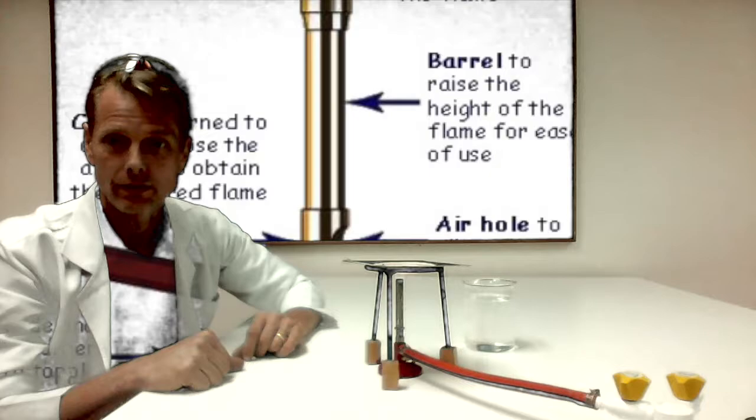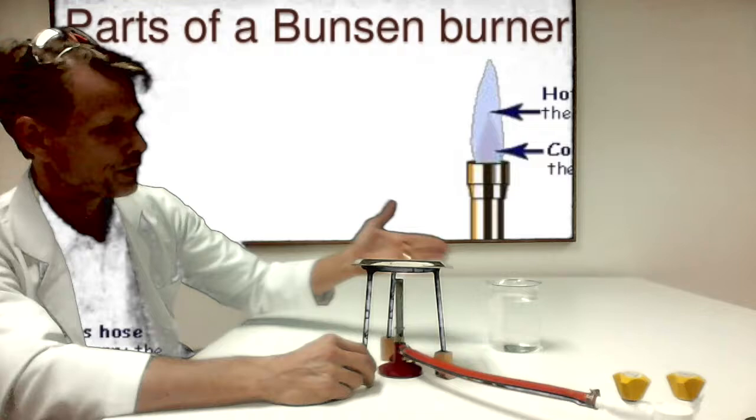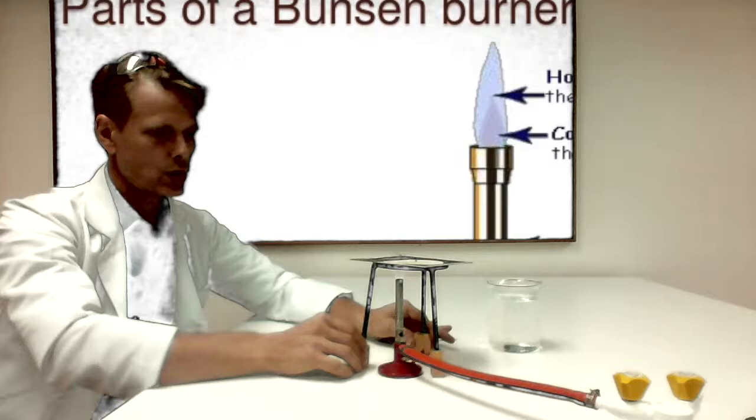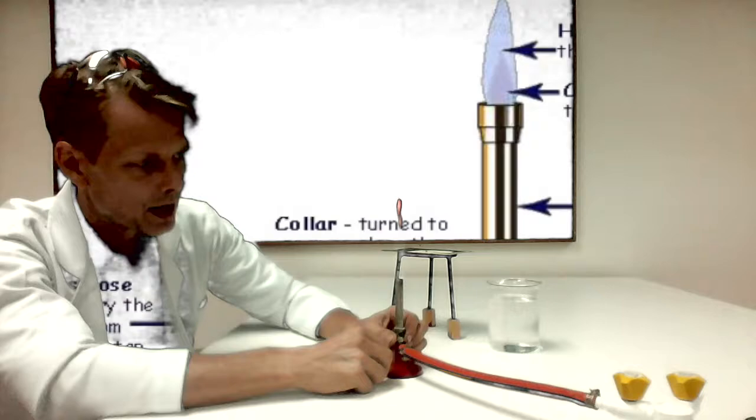This is called a tripod stand, often used atop a Bunsen burner to hold things that you would like to heat. Now, I shall light up the Bunsen burner. Like so. Can you see a flame? Yes, you can. A tiny flicker of a flame. This flame, even though it has a tiny bit of orange, is called a non-luminous flame.